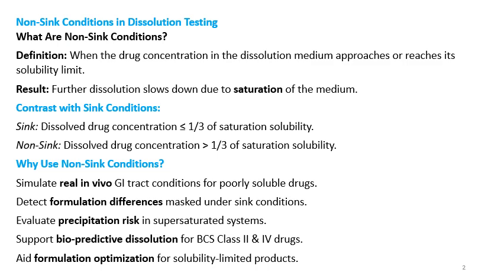Now coming to the non-sink conditions: when the drug concentration in the dissolution medium approaches or reaches the solubility limit, then it is called non-sink condition. That means your medium is getting saturated. The result of this non-sink condition may be that the further dissolution will slow down because of the saturation of the medium.